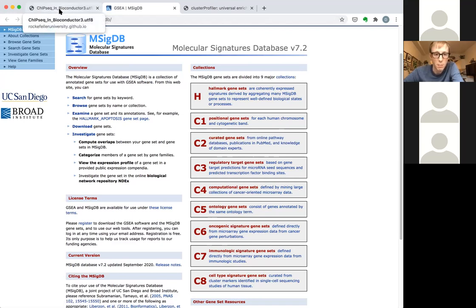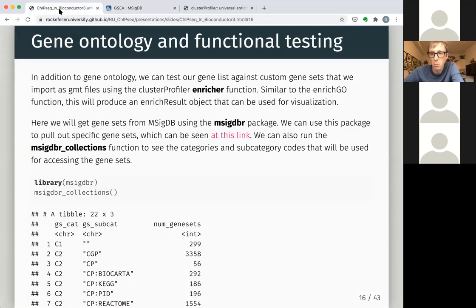You know, for example, some of these experimentally determined lists might be knockout of a particular factor. So if your peaks are enriched in a gene set when this factor was knocked out, then maybe your transcription factor you ChIP for might be related to that, because its gene list was enriched in your annotated peaks. So it's kind of just a nice broad set of gene lists.